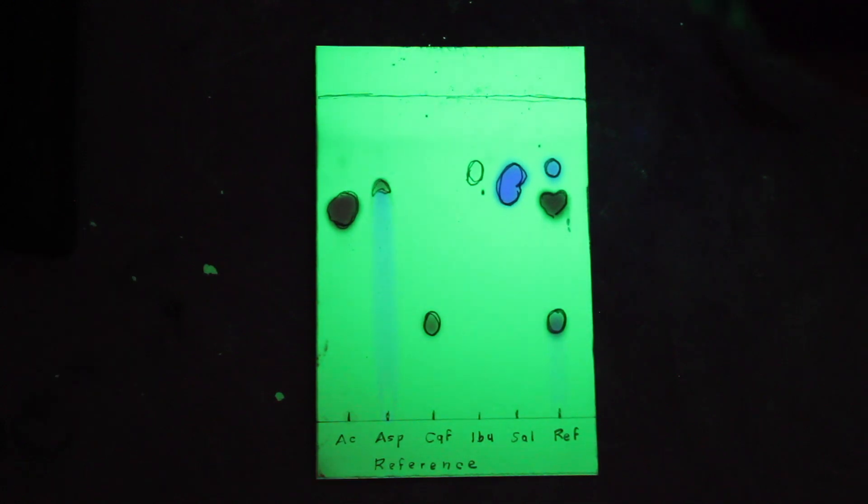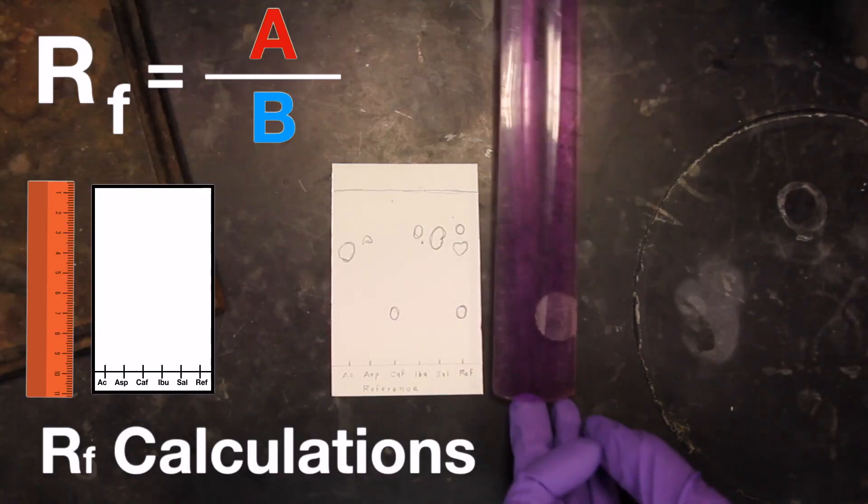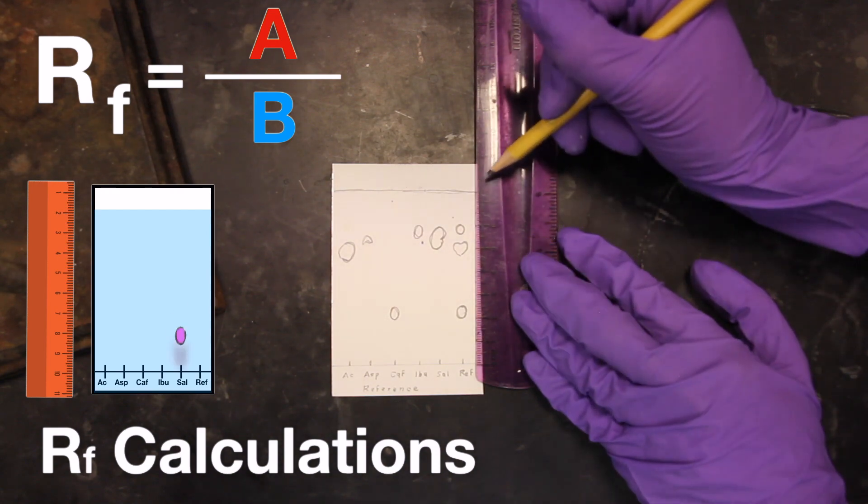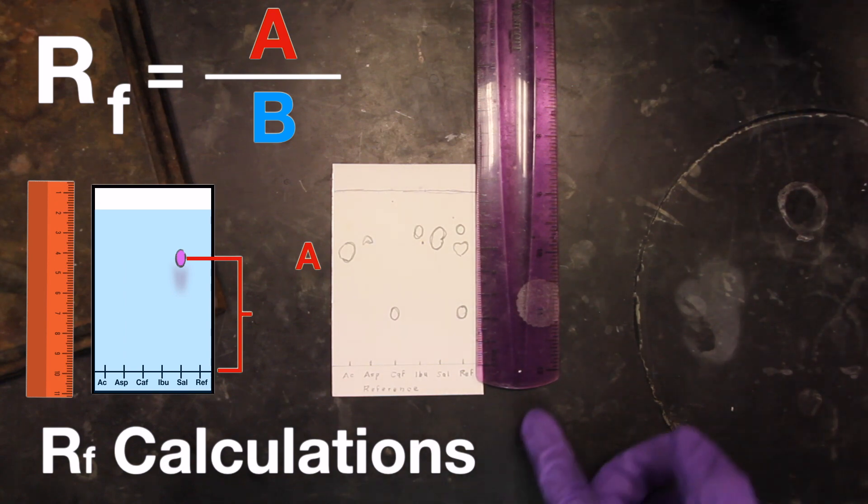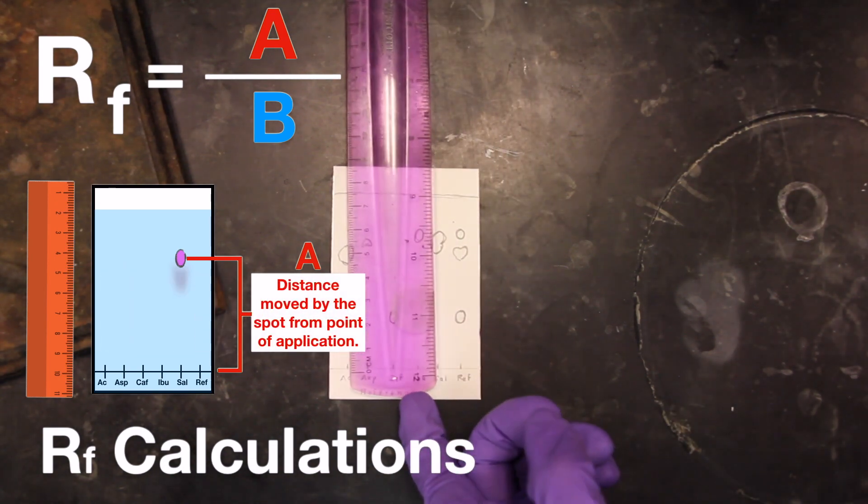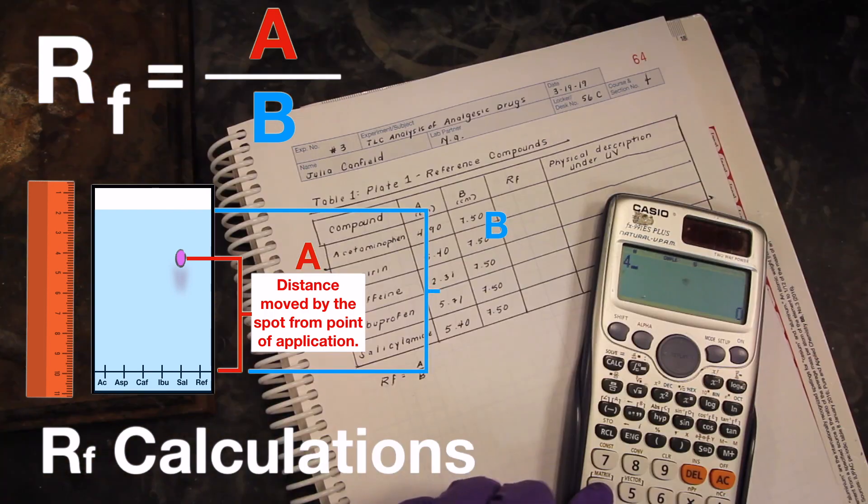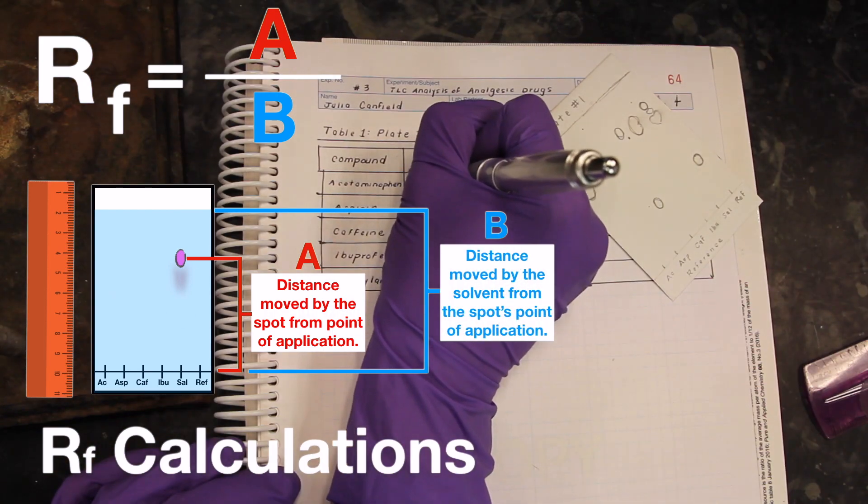Next, using a ruler marked in millimeters, you are going to measure the distance that each spot has traveled relative to the solvent front. To do so, calculate the RF value for each spot using the equation RF equals A over B, where A is the distance moved by the spot from point of application and B is the distance moved by the solvent from the spot's point of application. All RFs should be equal to or less than 1.